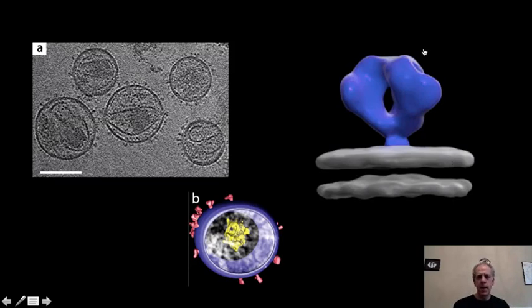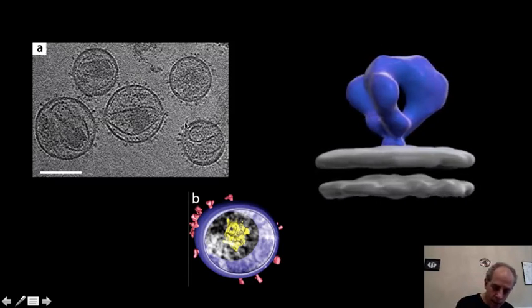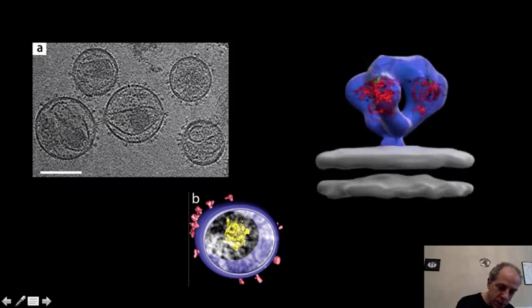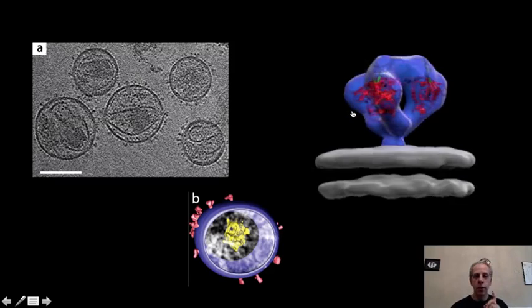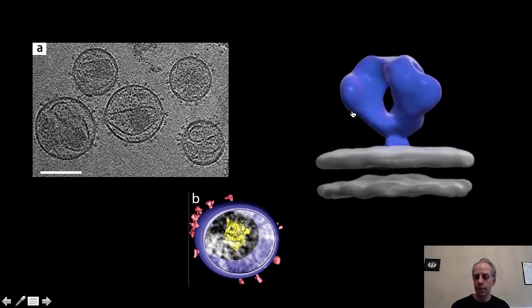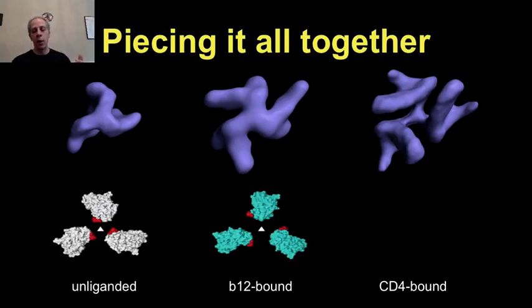Nobody has seen this in its entire composition, but they have seen pieces of them. So let's just try to bring them and see if we can fit them properly. So this is the envelopes that you see here. How do you go from here to here? Smart image processing. Once you have done that, you can start doing the biology.